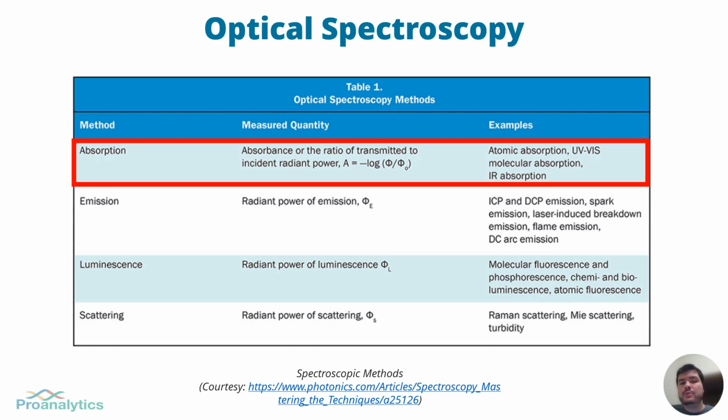The changes in the dipole moment of covalent hydrogen bonds result in broad and overlapping bands, as typically there are multiples of these bonds. NIR spectroscopy has advantages such as cheaper NIRS measurement equipment, the ability to measure absorption through thick container walls thanks to the longer path length, and much higher signal level for the same number of photons, resulting in lower exposure times. But NIRS has a major drawback for bioprocessing. It does not generate the same level of molecular specificity compared to Raman spectroscopy, which we'll discuss throughout the webinar.